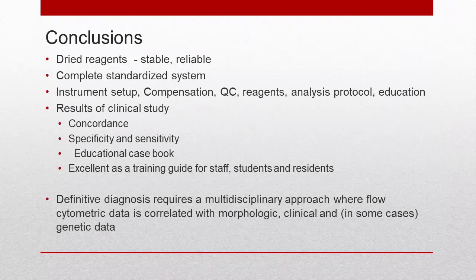There is an educational component to this as well, because if you look a little further down, there's an educational casebook that goes with this that was born out of the study that was done with the 4 flow cytometry labs. And this is an excellent training guide for staff and students. If you have any new staff, it's a good way to learn about flow cytometry, depending on how much you've seen before. It's also good for residents, because there are morphological pictures in it as well, I believe. So it gives them a complete picture of what a flow cytometry lab does.